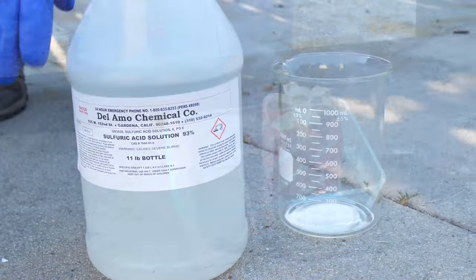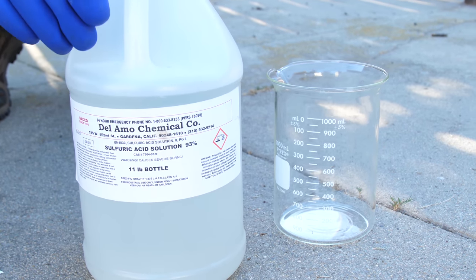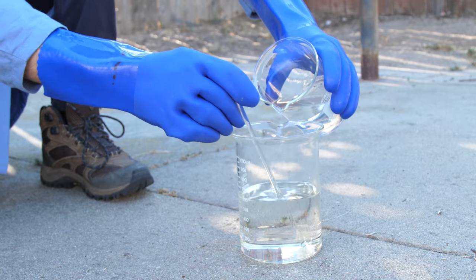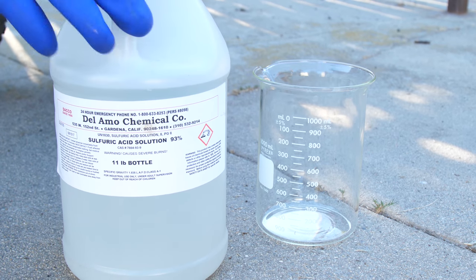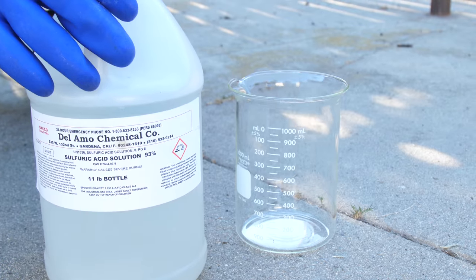You have to pour the sulfuric acid first, and then add the hydrogen peroxide to the sulfuric acid — not the other way around. This is an exothermic reaction, meaning it's going to get really hot. If you did it the other way around, it would explode in your face.